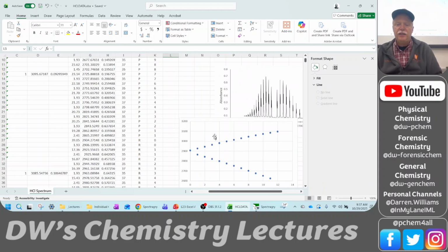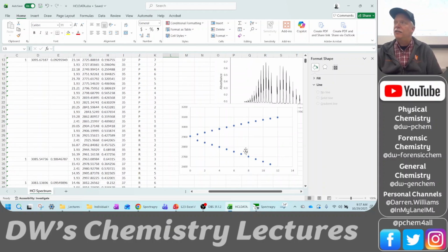Because we've got two trends here. We could do trend lines on these data, but we have then two answers. We have a bond length for the P branch and a bond length for the R branch, and that's no good because we have one molecule. Okay, so we want to combine the P and R branches. So we want to fold that P branch over to negative quantum numbers.